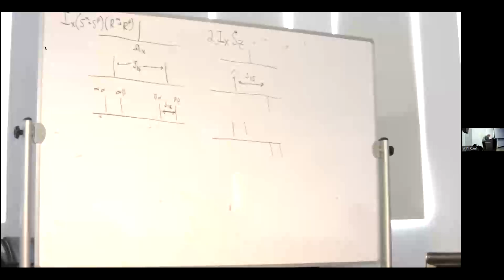The last problem, let me see. Problem 11 is a really important problem because the four A, B, C, D are basically building blocks that are just repeated over and over again in NMR spectra.